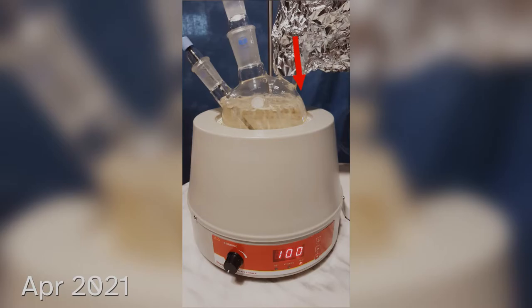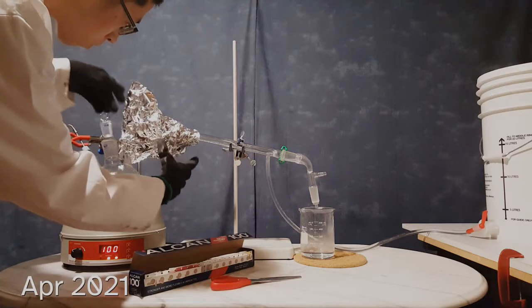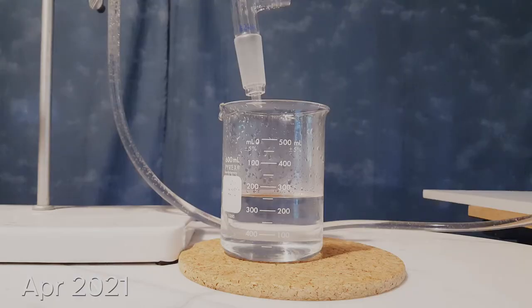This constant production of steam manifests itself as a rolling boil, so that's what we need to look for. You can see steam not really getting to the condenser and dripping on the side of this adapter, so I add a piece of tinfoil to insulate it all. At the end of the condenser, we have a drip tube leading into a beaker. The end is open to the room air because heating a closed system is generally explosively bad.